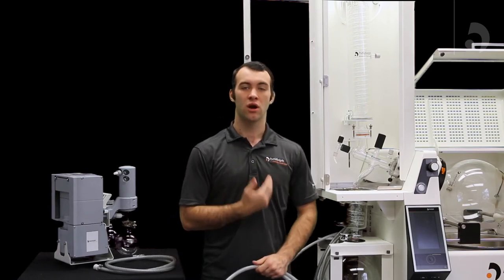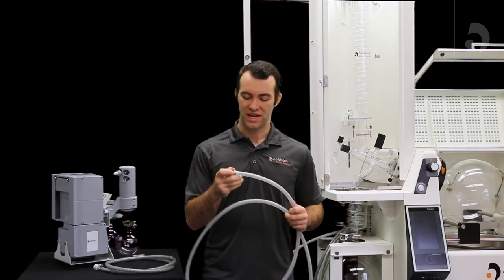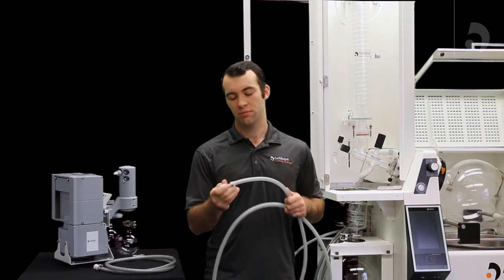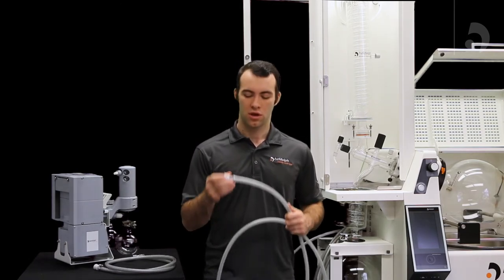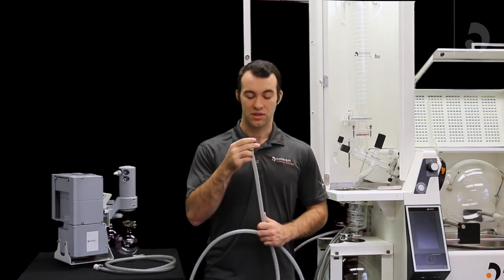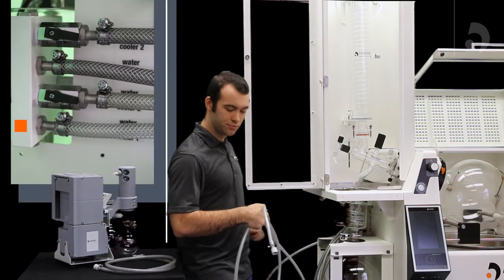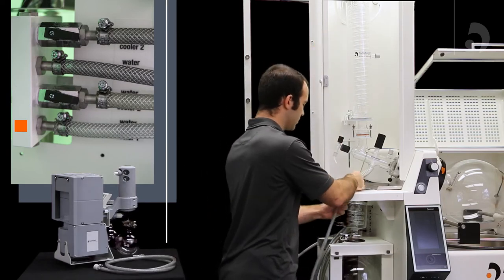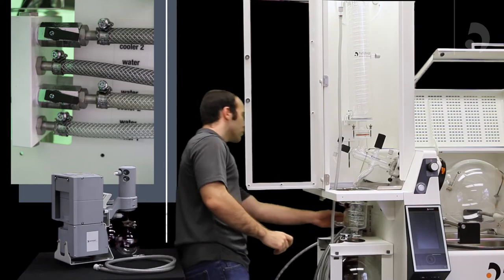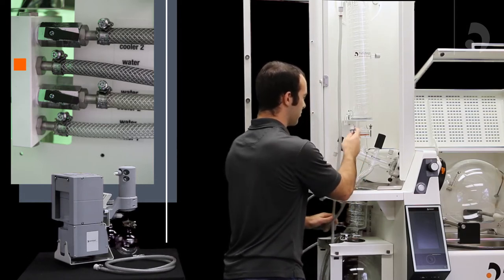Now we're going to attach our coolant tubing to our condenser, our mini condenser, and our vacuum. When attaching your tubing to your barbed connectors it can be a little difficult — I recommend using a heat gun or dipping the tubing in alcohol first to help slide it onto the barbed connector. Also, it's very important to use a ring clamp to secure the barbed connector to the tubing to prevent leakage. The first tubing, coming out of your unit from the cooler out one, will go through your housing to the top of your condenser. Then, coolant in one will go through your housing and into the bottom of your main condenser.